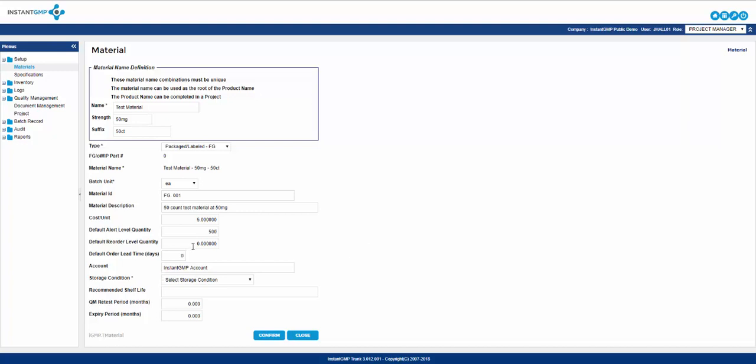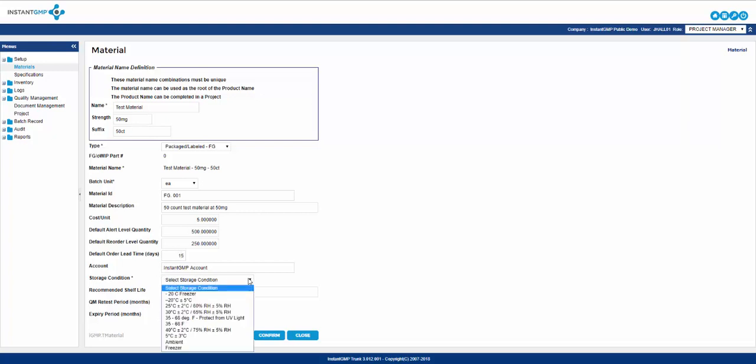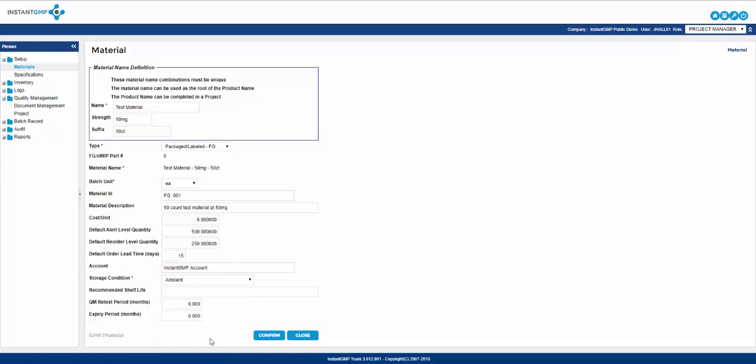Default reorder level is identical to alert level, but this is a warning to say material should be ordered. Default order lead time in days is utilized in the material resource planning aspect of the software. Account for material is utilized in the QuickBooks functionality. Storage condition allows you to choose which storage condition this material will need upon receiving or creation.